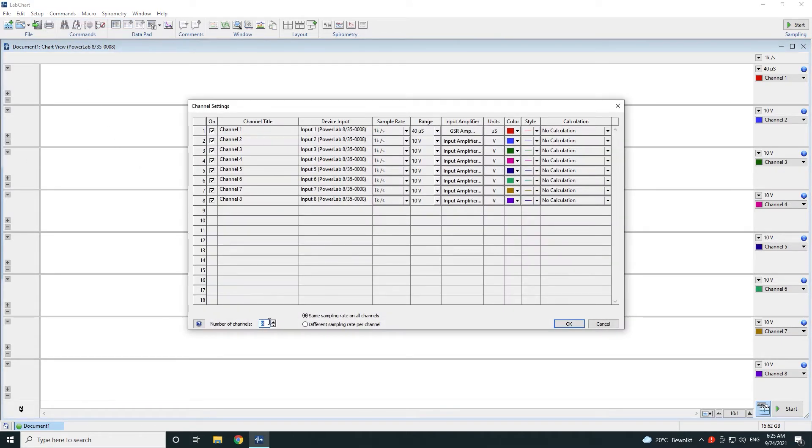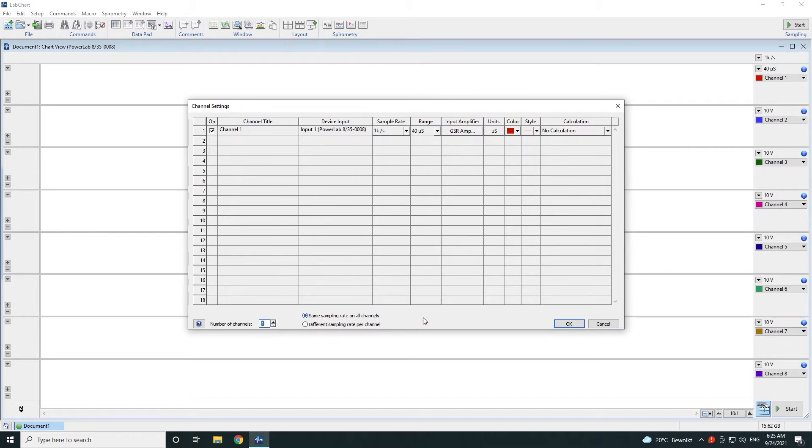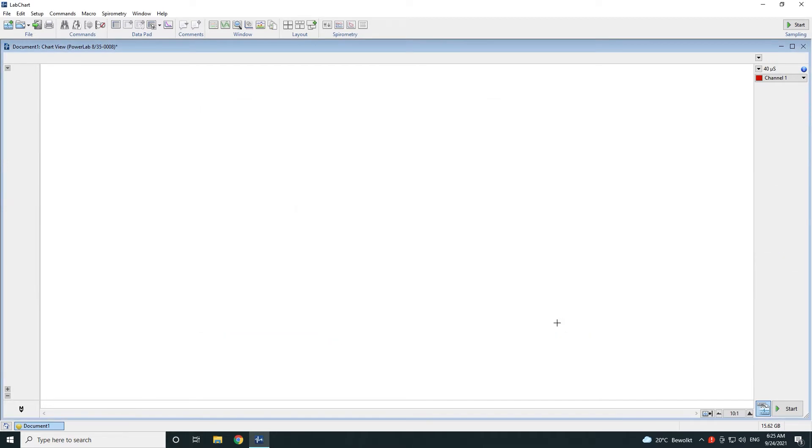Set the number of required channels and then click on the GSR amp in the drop-down list of the channel it's connected to.